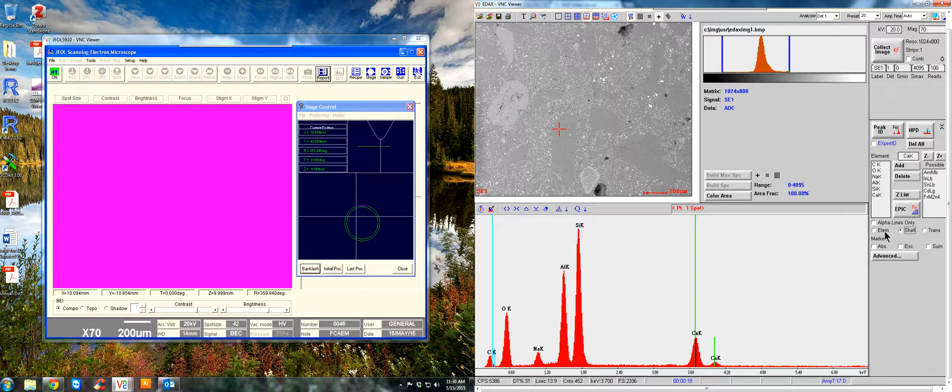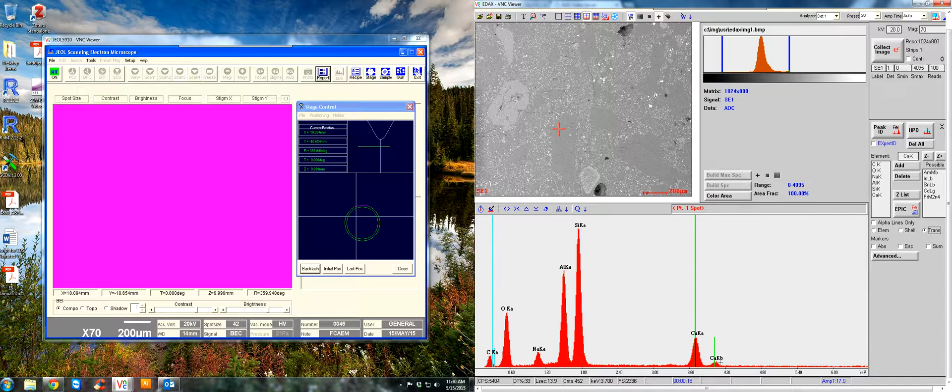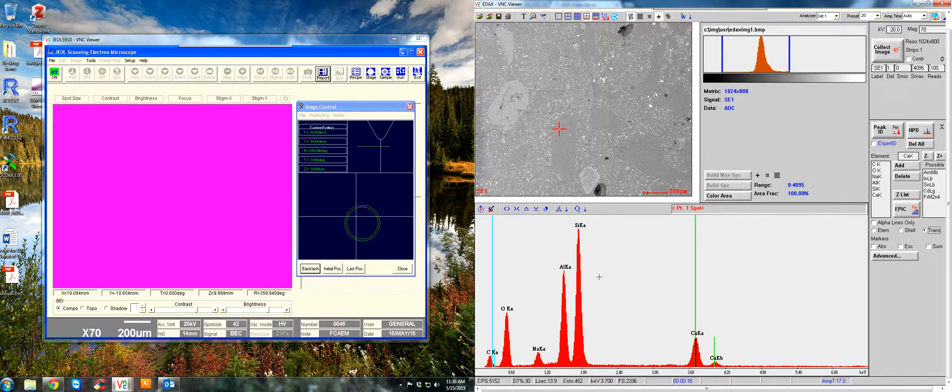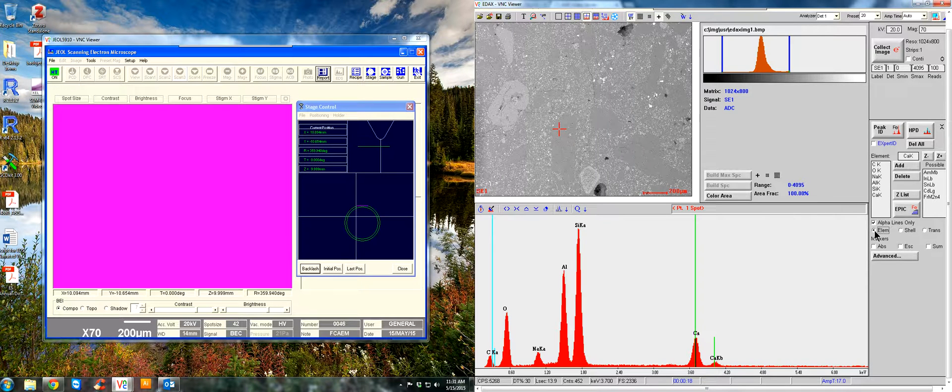So now you'll see. There we go. This will show you that this is the calcium K-beta peak, calcium K-alpha peak, and so forth. A lot of times, since I'm used to it, I like to just show the alpha lines only and just the element.